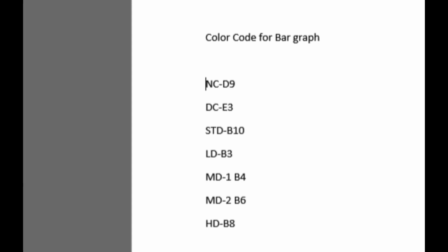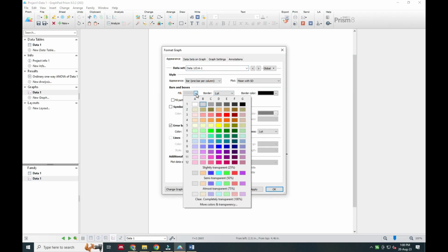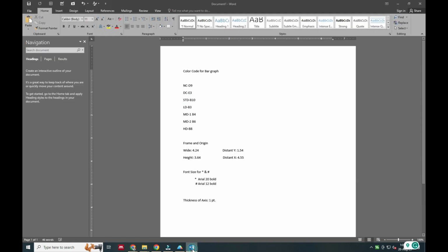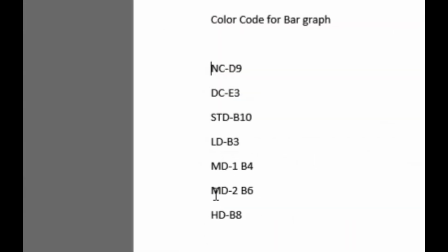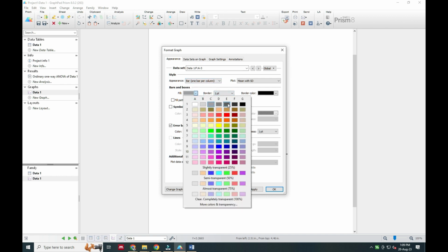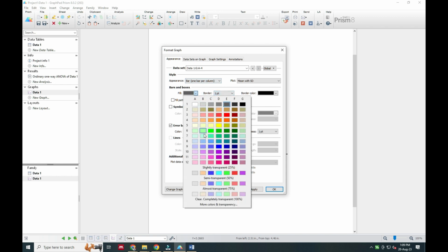these are the bar graphs, and group-wise they are completely different from each other. So these will be easily, distinctly differentiated from each other, and anyone judging your article can see whether the groups are visibly different or not. So this will be easily acceptable by the publishers.